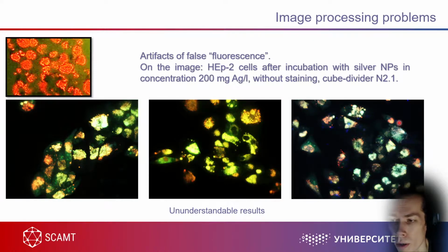Maybe probably because the cells were dying, and in some cells, as you can see here, there are a lot of organelles which stained inside, a lot of these small spheres, these apoptotic bodies. So these cells undergo apoptosis, and maybe because of different pH inside of these apoptotic bodies, acridine orange shows a completely different color, so like 50 shades of orange.